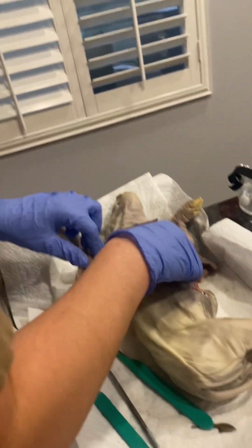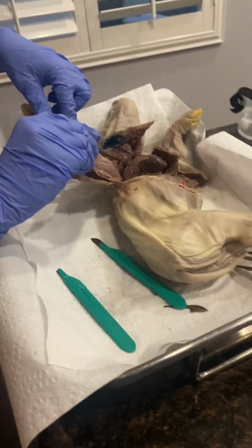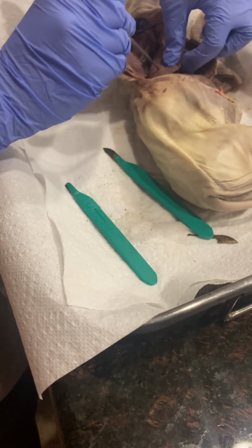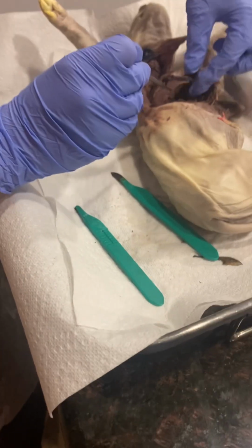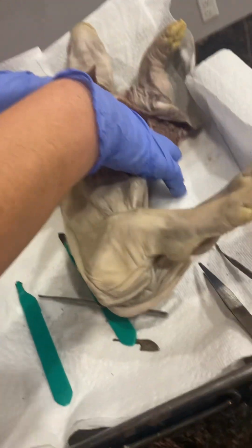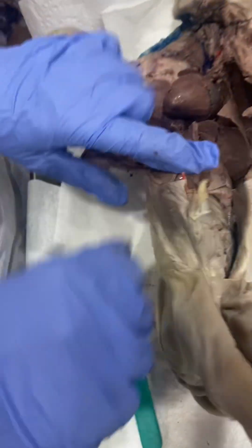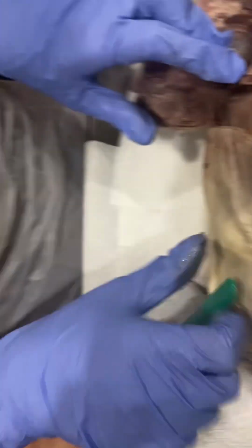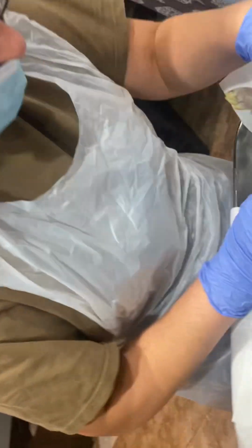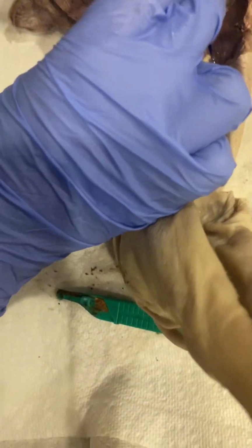And then here's the lungs. So the superior part of the right lung, and then the middle part of the right lung, and then inferior right here, and then the left, if I could just find this lung hiding back here. Stuck. Okay, so we got the superior and the inferior part of the left lung, right here, right there.